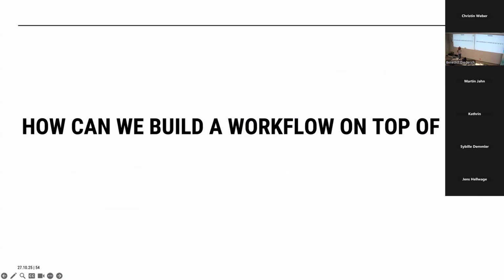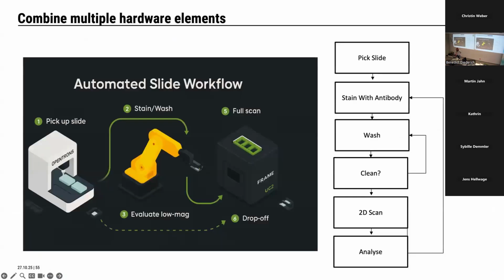I think there's a trend going on about lab automation, and there's also something where we try to apply it. It's not production ready yet, but there's also a very nice benefit of open source software. So we see the microscope itself as a little robot. So you have, for example, pipetting robots. In our case, that's an Opentrons. There's a little robot arm that is eventually moving slides back and forth.